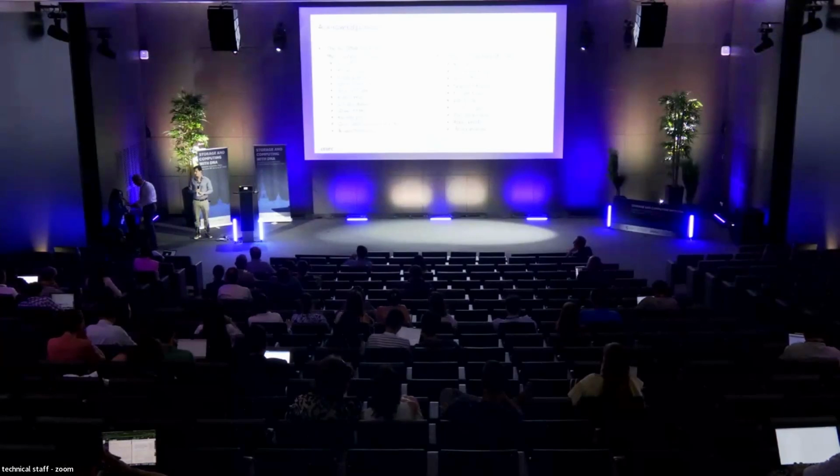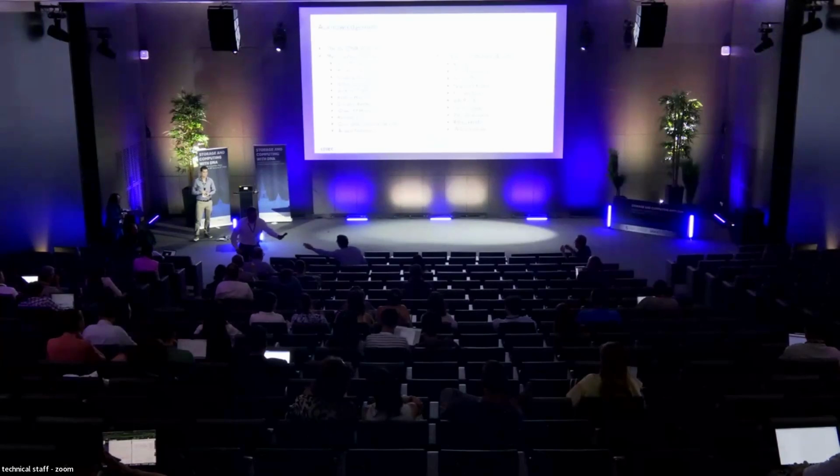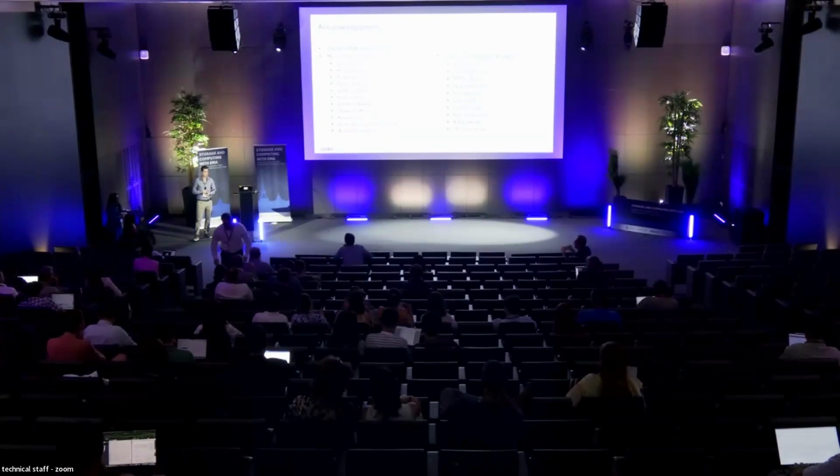So thank you, Kerim. Any questions, comments? Thanks very much for the very nice talk. Can you comment about your views on reusability of these chips? For DNA synthesis using electrode arrays, it seems that reusability might be an important issue. Is that something you think is true?